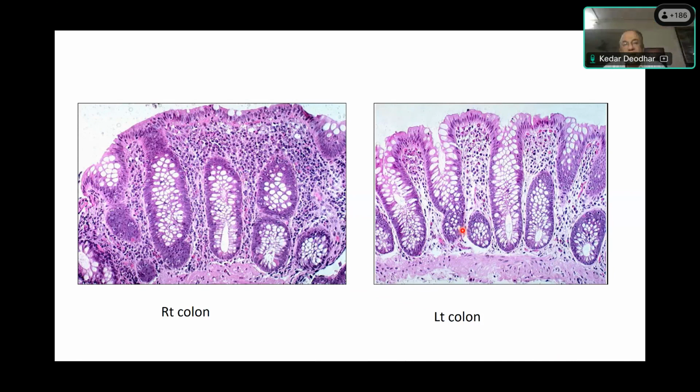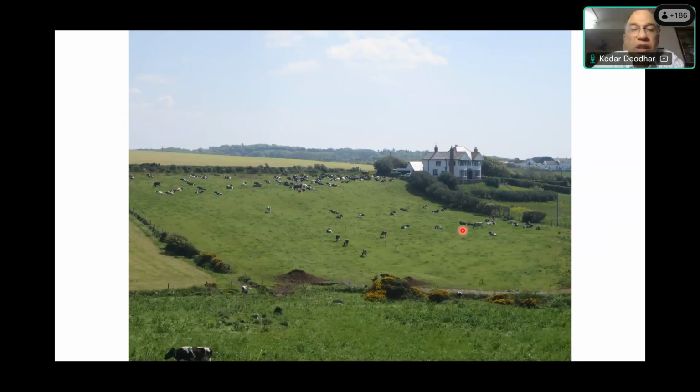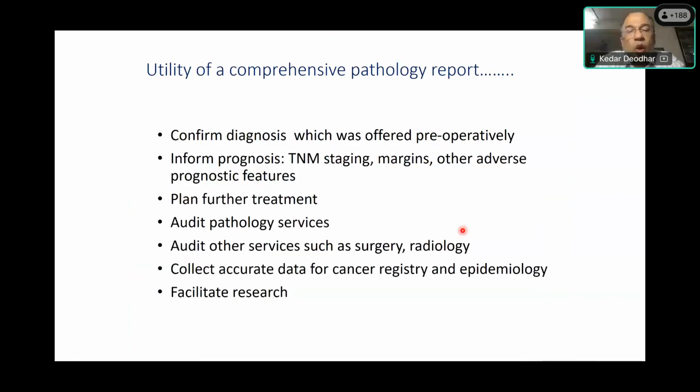So with that, the short histology matters will go on to the grossing matters, and we'll deal with about 3 organs: stomach, gallbladder, and colorectum. I'll take maybe slightly longer time for the colorectum.